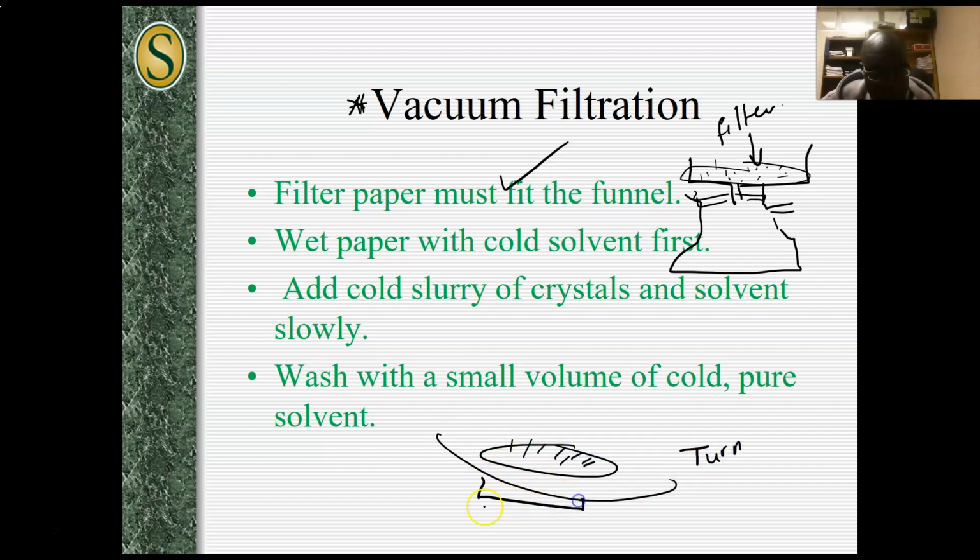Label the watch glass with a tape. If your name is Moses Ihachi like me, you put MI and then you put the name benzoic acid, and that's what you'll turn in to me. We'll have to keep it to dry. We're not gonna weigh the sample on Thursday the same day. We have to wait until it dries.